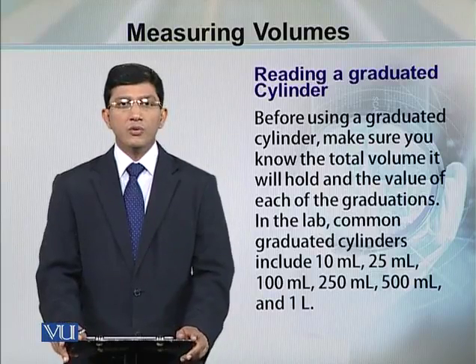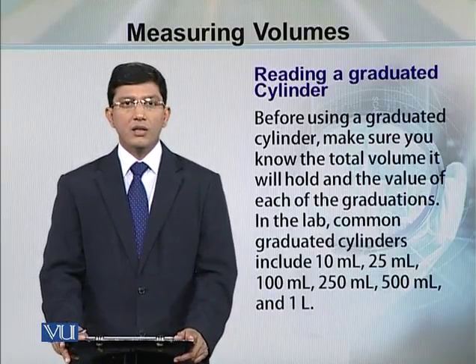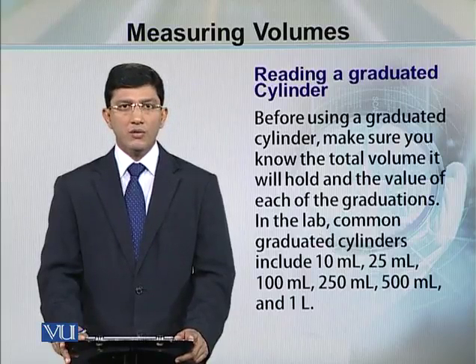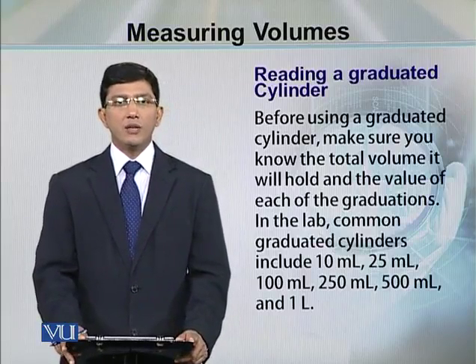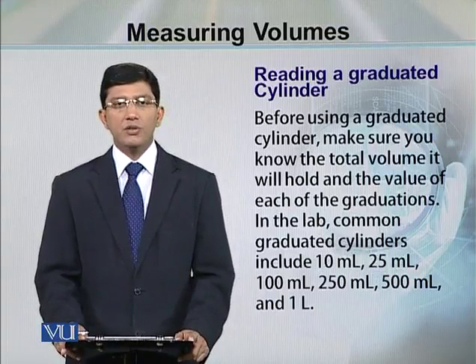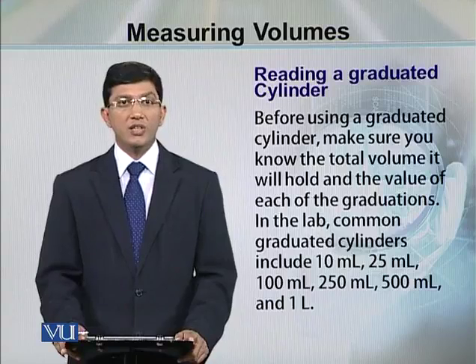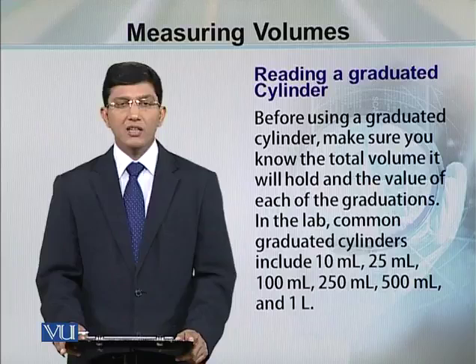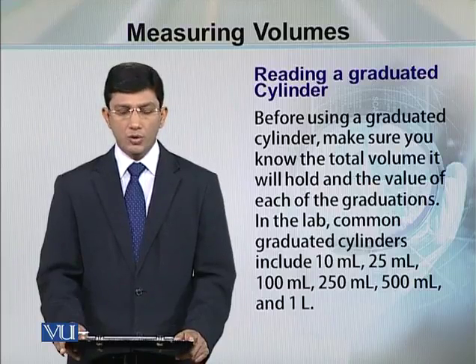So always use a specific graduated cylinder for a specific volume. For example, if you need to measure a volume of 20 milliliters, it is preferred to use a graduated cylinder of 25 milliliters, not of 100 milliliters, because it increases the error in the volume.